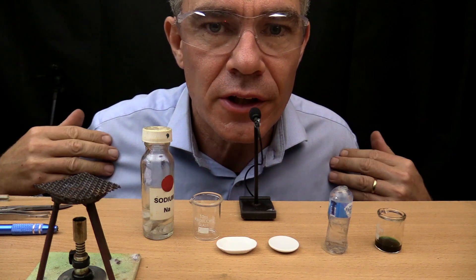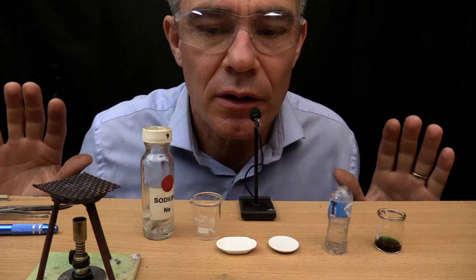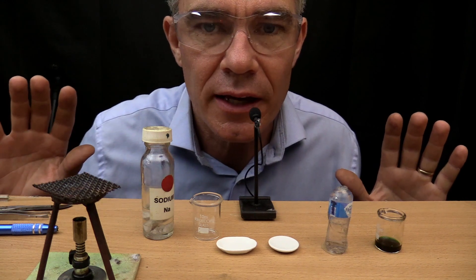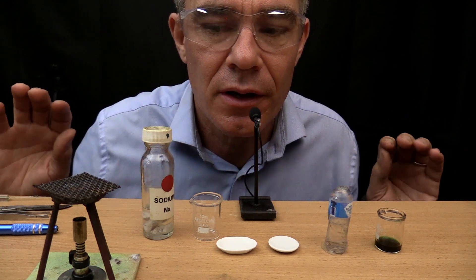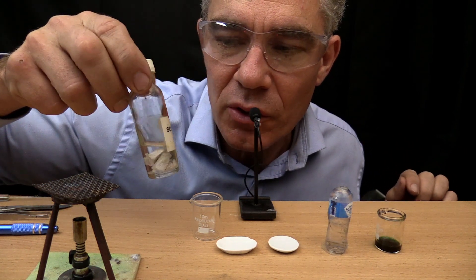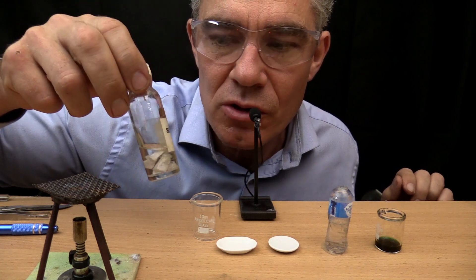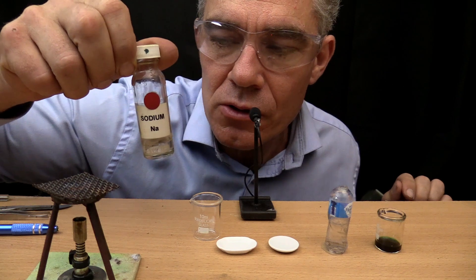G'day, I'm Jacob from Make Science Fun. Thanks for joining me on this tiny science ASMR episode. I'm very excited because today I'm going to be looking at a very dangerous element called sodium. Sodium.